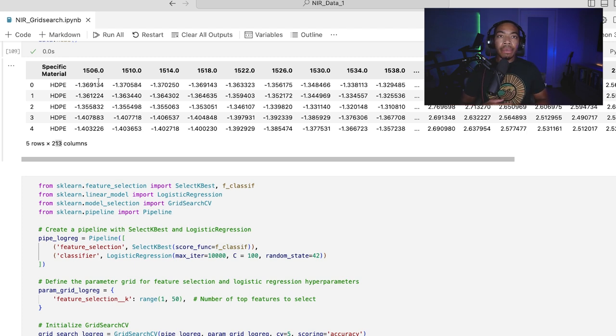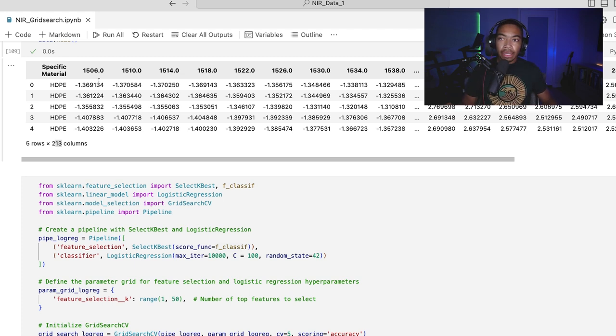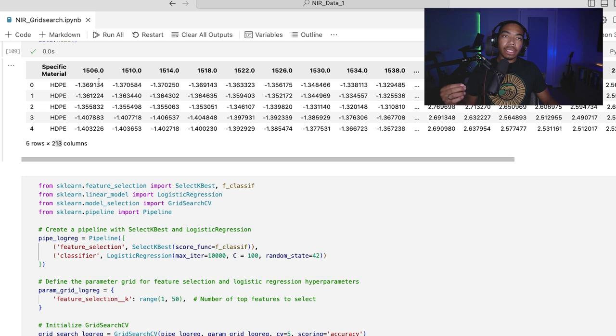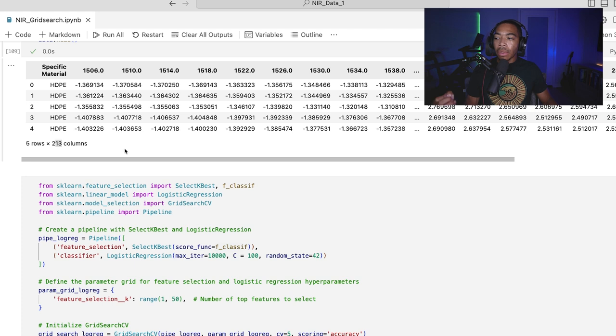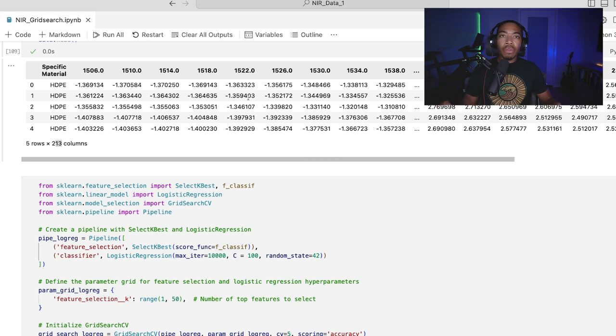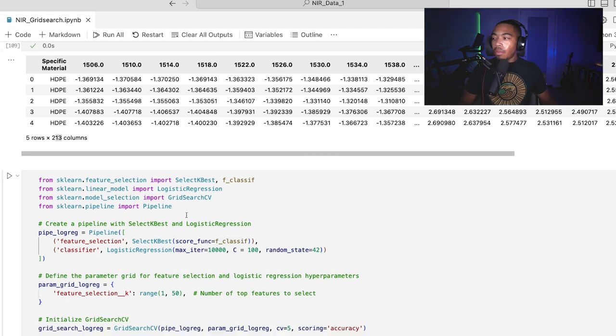This data comes from near IR data of several plastics, high-density polyethylene, low-density polyethylene, polyester, polypropylene, and a few others. And we want to build a strong model, but we're going to focus on removing the variables that are less informative.